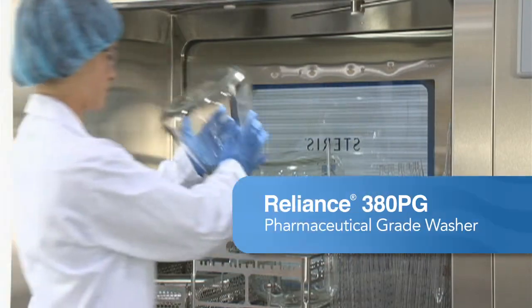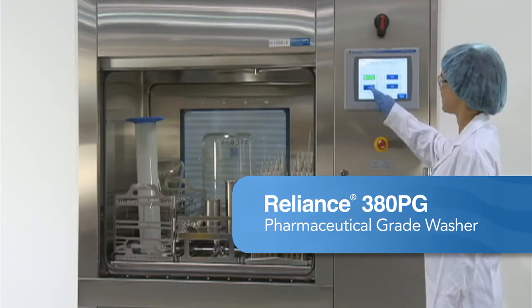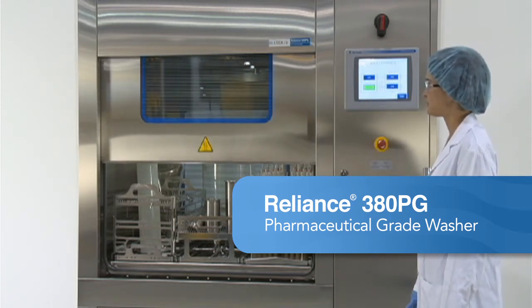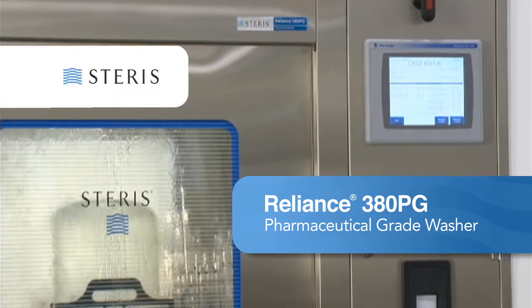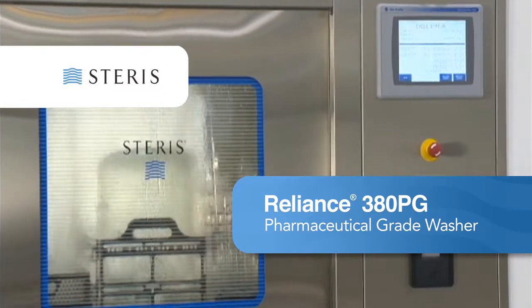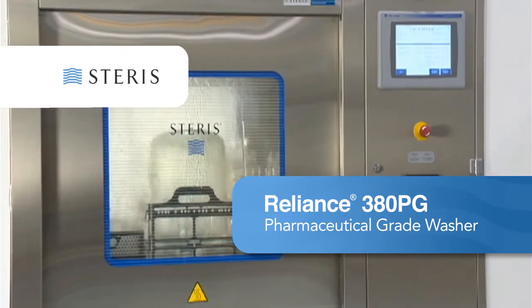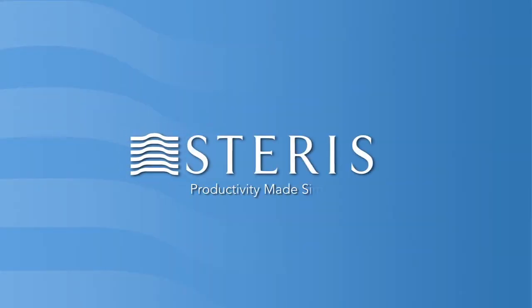The Reliance 380PG pharmaceutical grade washer is a highly efficient and complete solution that can handle most component cleaning and drying challenges in your pharmaceutical manufacturing facility. When combined with Steris' unmatched global service capabilities and scientifically proven formulated chemistries, the Reliance 380PG washer will help you meet your processing and productivity goals. Productivity made simple from Steris.